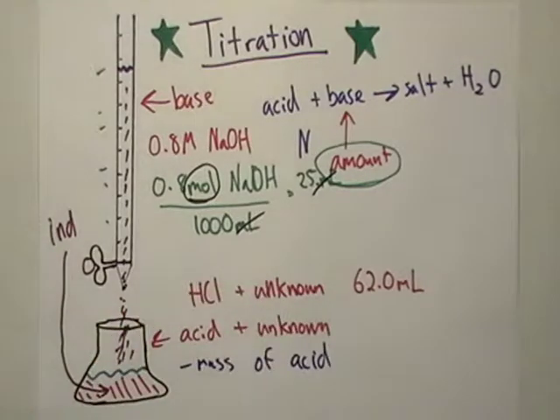Well, what happened right there? It's just a faint color change. Well, that means this sample right here has turned just a little bit basic. Basically, all the acid has reacted with the base in here, and now it's just tipped just over the point of neutralization.